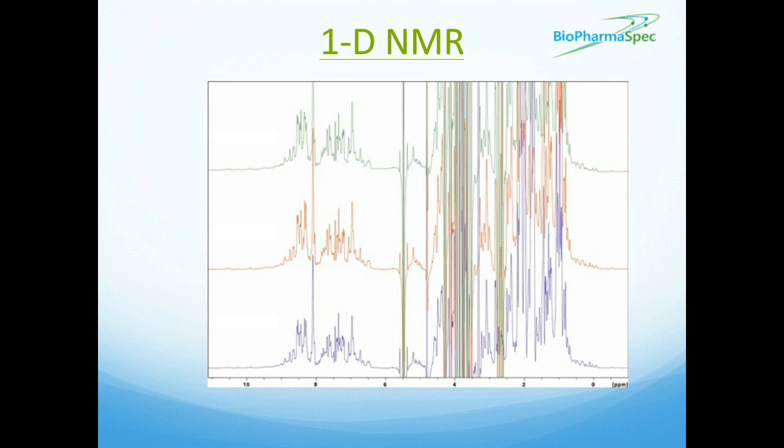The 0 to 0.5 ppm peaks belong to the aromatic ring-induced upfield shifted methyl and methylene groups of the hydrophobic core, and the peaks greater than 8.5 ppm arise from the backbone amides from the secondary structural elements. It's only these two extreme regions that represent unique signatures for the protein sequence and secondary and tertiary structures. But taking that into account, you can see there actually is quite a high degree of spectral similarity for these samples, which suggests good comparability between this biosimilar and its 2 RMPs.